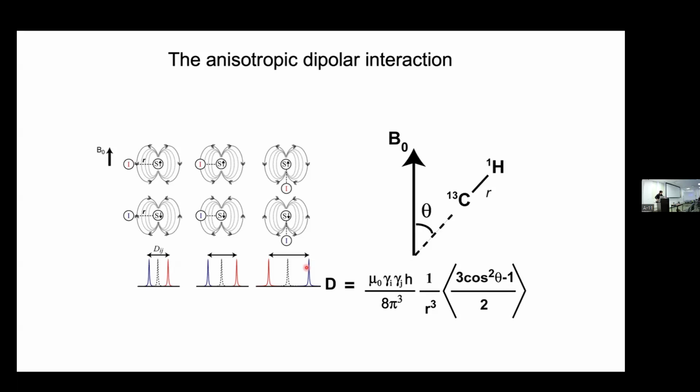Proton is great. What about carbon? Is carbon better than nitrogen? So here carbon wins, right? You'd say, oh, better off measuring CH bonds than NH bonds because the CH coupling would be bigger. Okay, and so that's the magnitude.